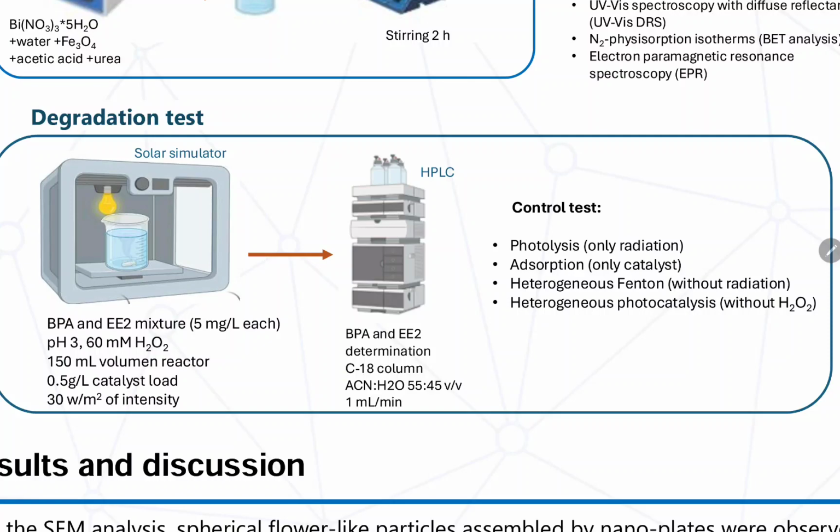Then we take samples every 15 minutes for 2 hours, and then they are read in the HPLC with the following conditions that we present here. The control tests we made were photolysis, only radiation; adsorption, only catalyst; heterogeneous Fenton without radiation; and heterogeneous photocatalysis without hydrogen peroxide.